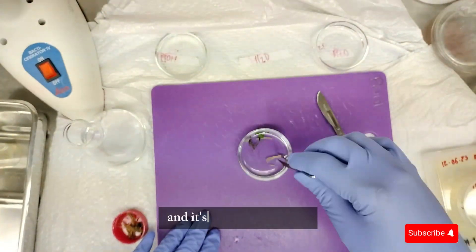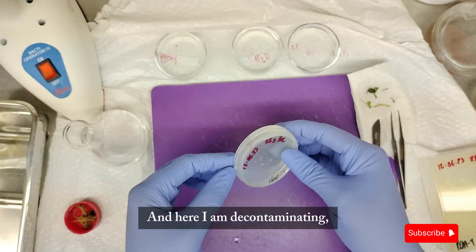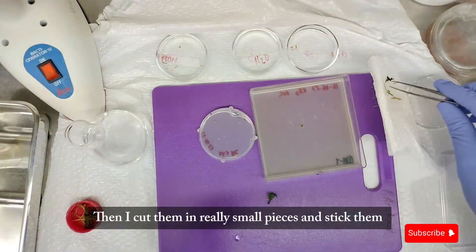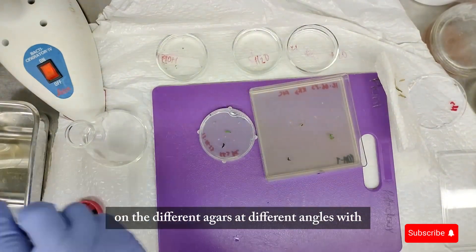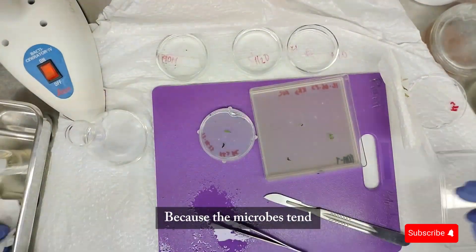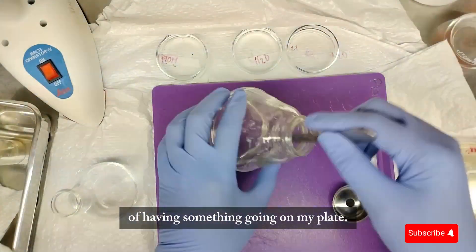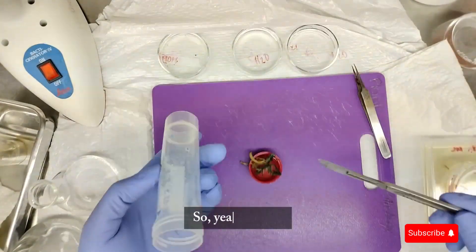I take a photo of the sample because a picture is worth a thousand words — it's part of my observation process. Then I decontaminate the sample: rinse in water, dry, rinse in ethanol, and so forth with bleach. I cut it into really small pieces and place them on the different agars at different angles, with enough room between them. Different angles because microbes tend to grow on different surfaces of the material, so I want the best chance of getting growth. I decontaminate with ethanol again in between.